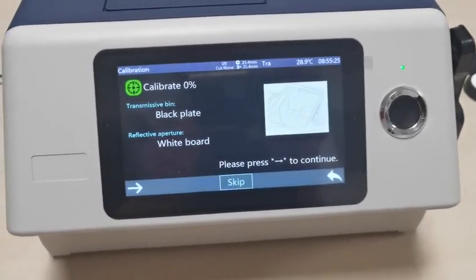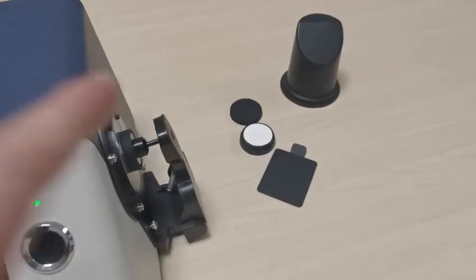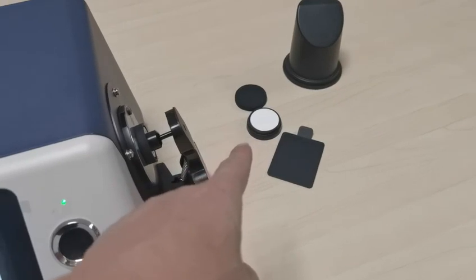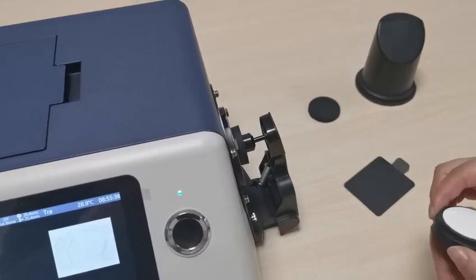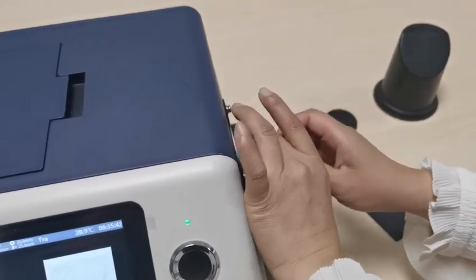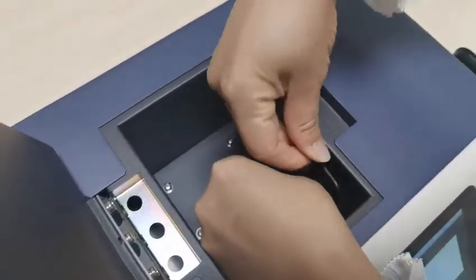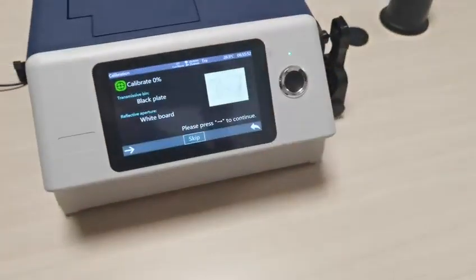First is the zero calibration. We need to use the black plate and the white board. First, put the white board on the click, and then the black plate in the cavity. Press the test button.